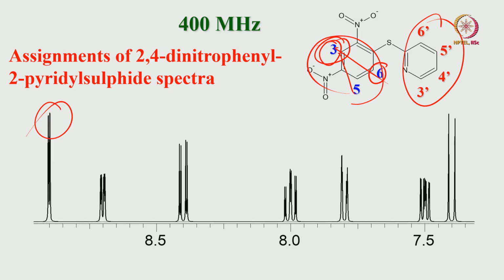And then you look at the other thing. Then if you look at this one, this experiences an ortho coupling and a meta coupling.